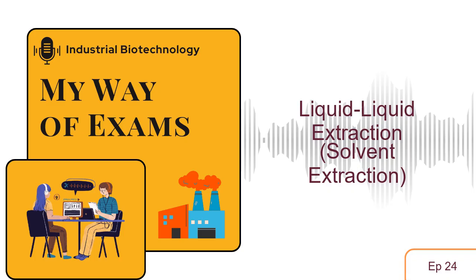So liquid extraction sounds pretty basic, but it hinges on something we all know. Certain liquids just won't mix, like oil and water. When you have two of these liquids that don't want to mingle, and you throw in a third substance, it's going to distribute itself between the two. It's called partitioning. What's crucial here is the distribution coefficient, or KD. Basically, it's a ratio telling you how much of your target substance is in one liquid versus the other. Usually, a higher KD in the solvent you picked means it's pulling more of what you want.